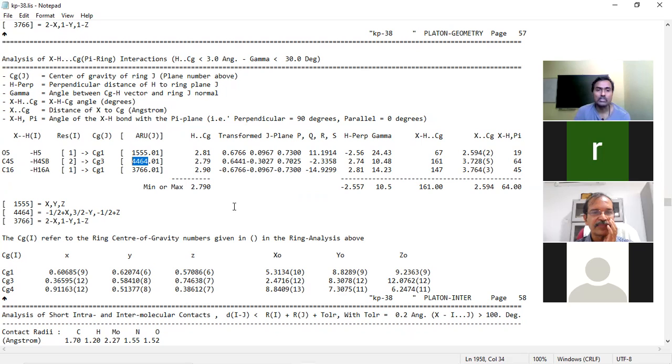Only we use this polyhedron type. In some cases we have used dotted lines also, because some reviewers don't want to make the picture clumsy. In those cases they will say remove that polyhedron or something like that. In those cases we will put dotted lines.